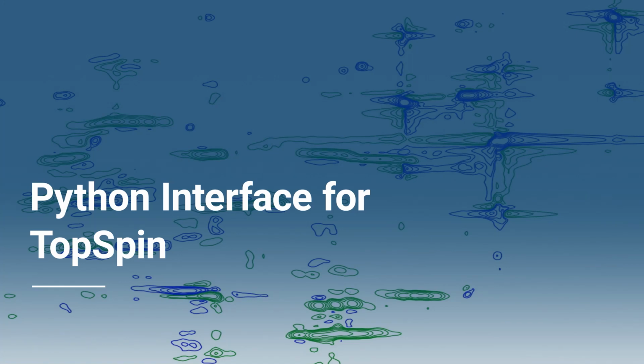In addition to the existing Jython interpreter, TopSpin now offers a Python API. Bruker Python packages come pre-installed with every download. So what does this mean for you? Let's take a look at this in more detail.